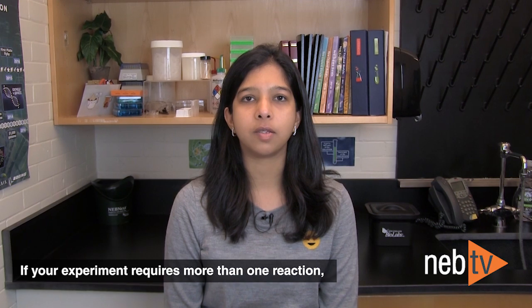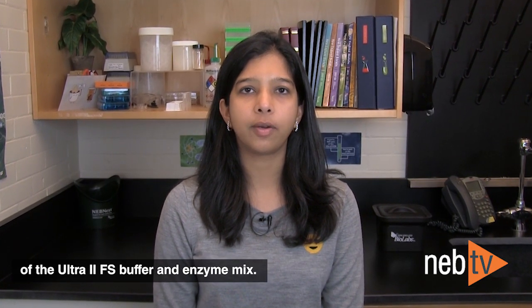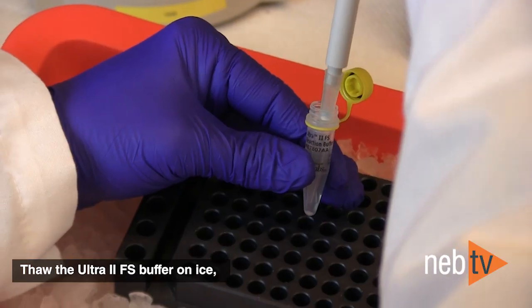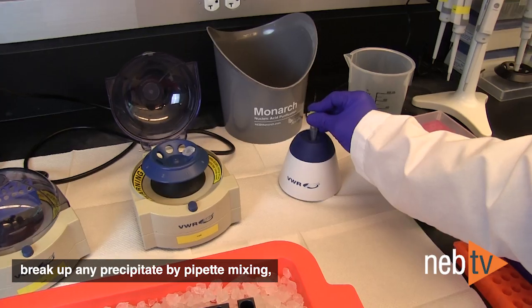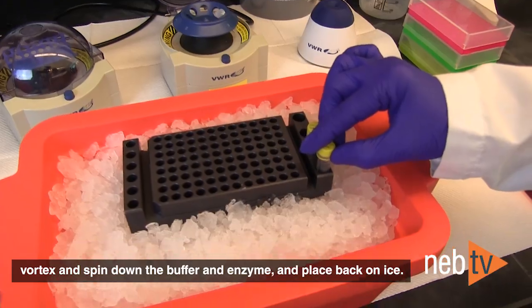If your experiment requires more than one reaction, you could make a master mix of the Ultra2FS buffer and enzyme mix. Thaw the Ultra2FS buffer on ice, break up any precipitate by pipette mixing, vortex and spin down the buffer and enzyme, and place back on ice.